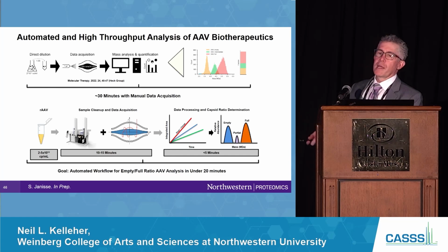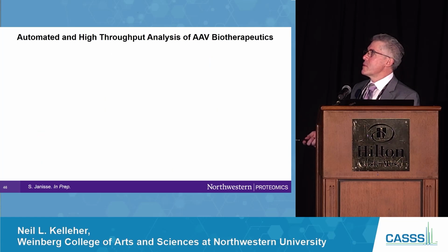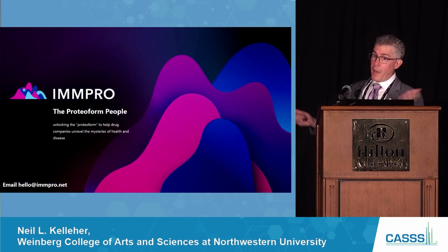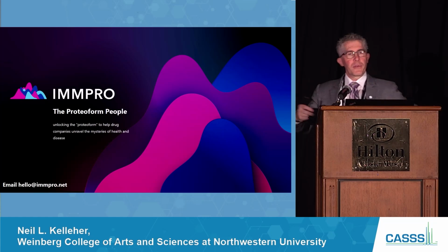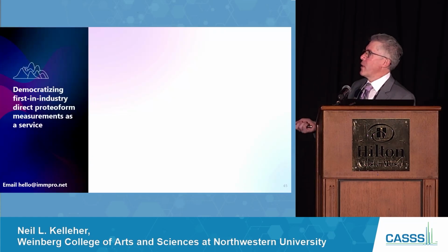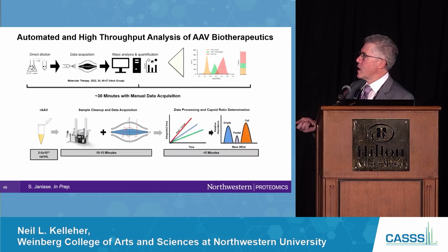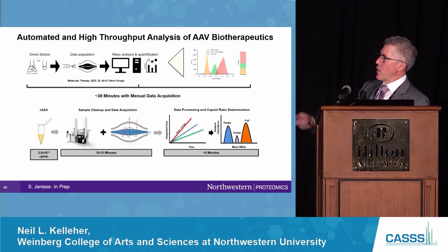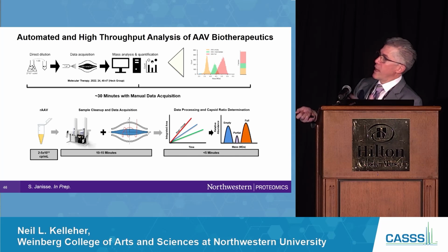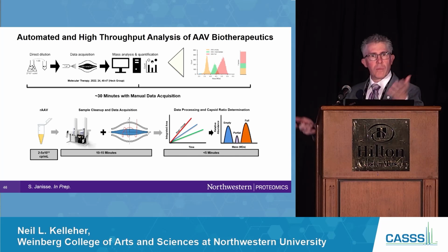And so there's an academic paper coming out on it. But really, it was designed to go here, right? That's translation in academics, and so that's the spirit of my answer: to not oversell, and say that is what it was designed to do. The components of it are industrial grade, so the UHMR that this thing's attached to, that's all you need. And the methods, each of these has LC-based methods in the sample stream unit that are robust.